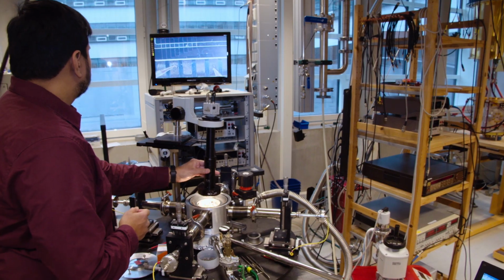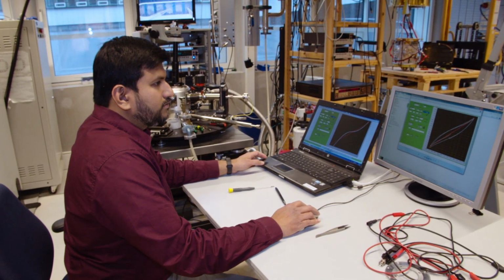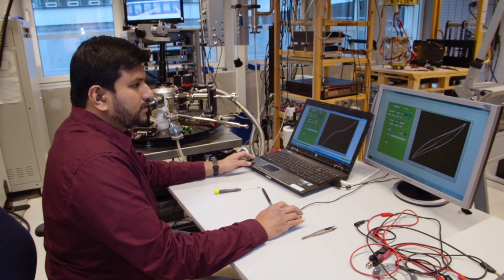When the chip is ready, we carry out measurements on the sensor. The data is analyzed for determining various parameters, including the concentration of the biomarkers we want to scan. When we got the breakthrough, we started our company ECSens to develop an idea into a working clinical product.